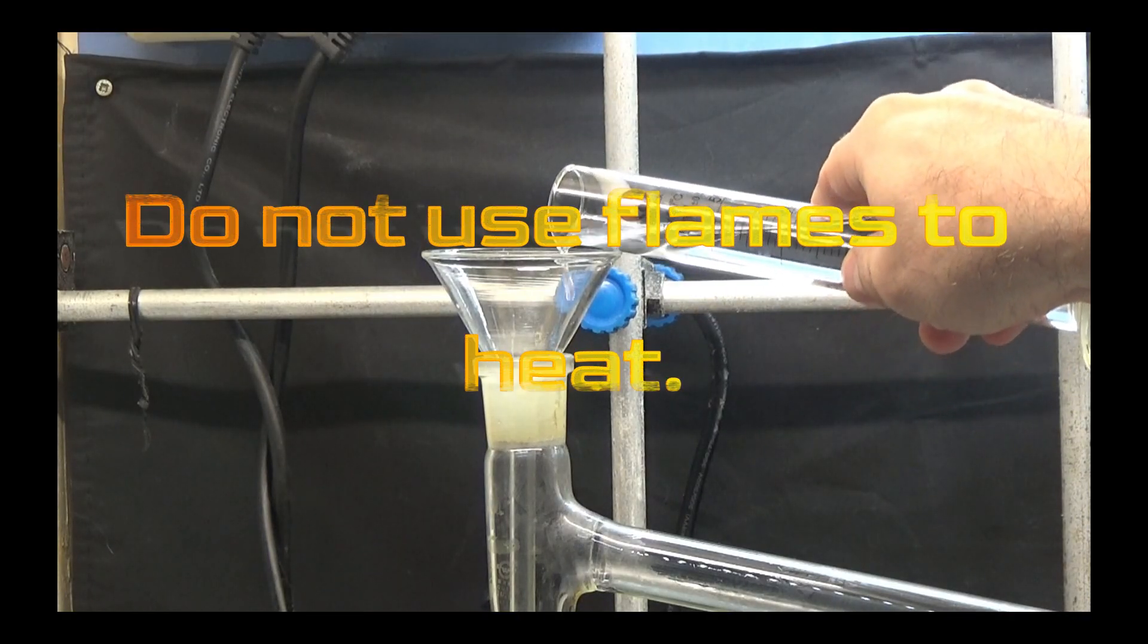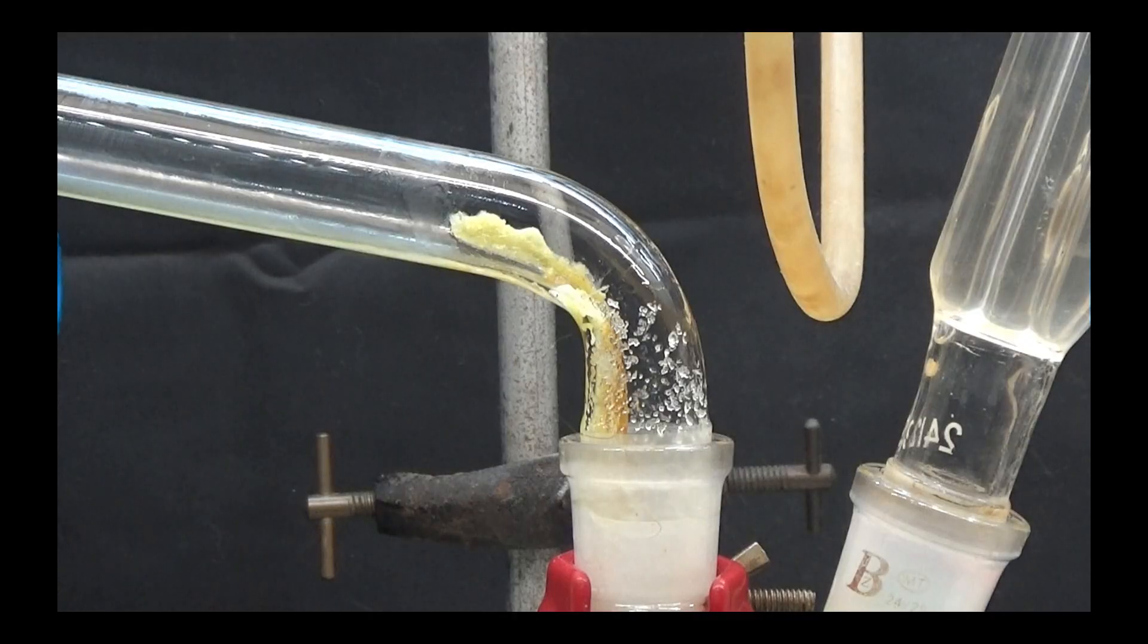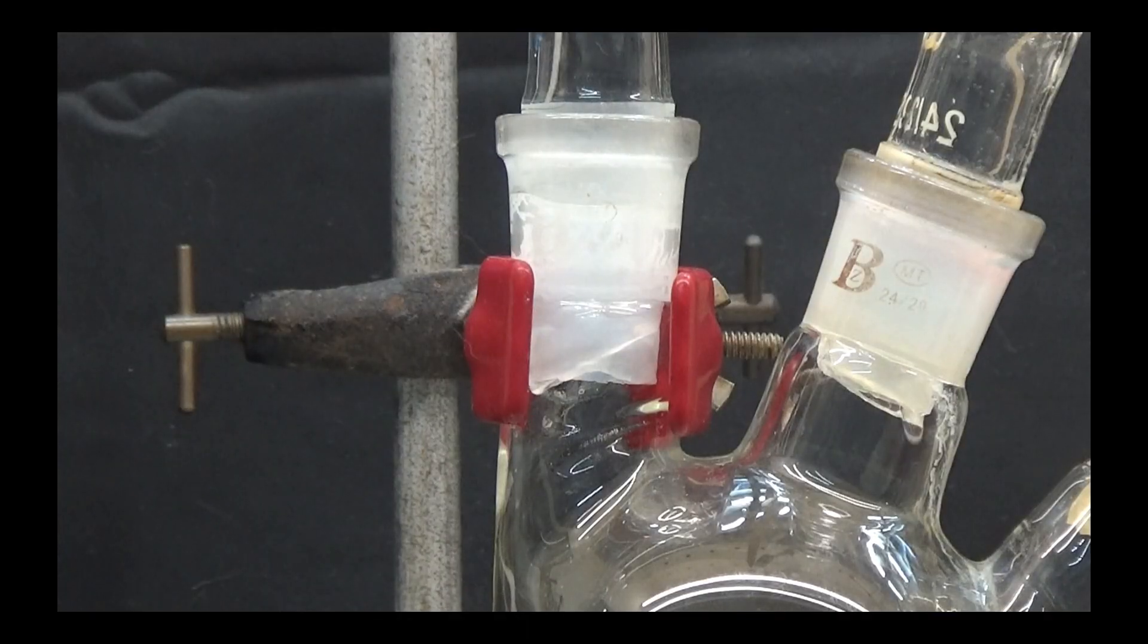If the tube is blocked by the succinimide, cool the distillation flask and distill, with a heat plate, a few ml of acetone that will dissolve the solidified succinimide in the tube.